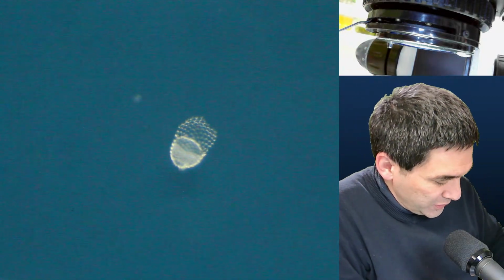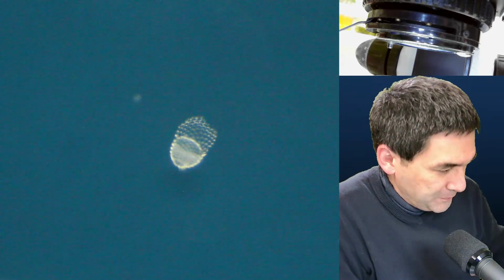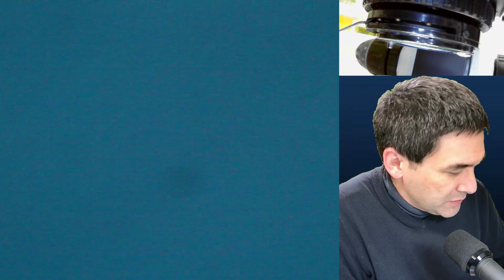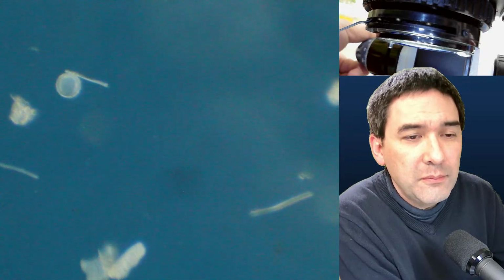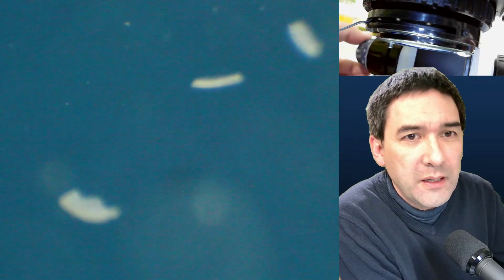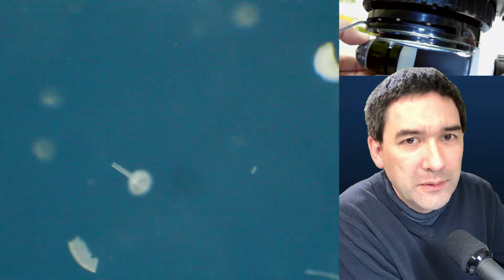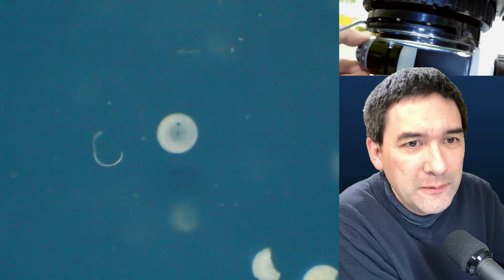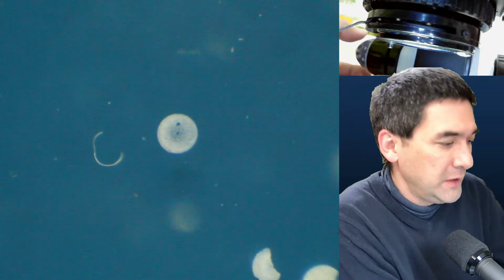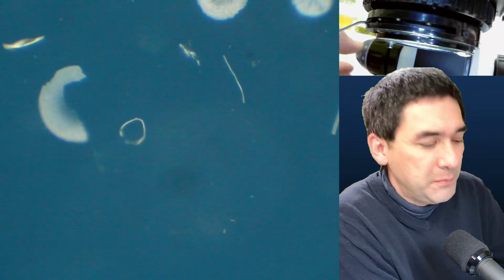Okay, I'm going to show you another example that works quite nicely, and they seem to be marine diatoms. Okay, so diatom shells are also made of the same material, silica. And these are many diatoms. It's more blurry than actually when you look directly under the microscope. Yeah, so the image quality is not quite as satisfactory, unfortunately. But here again, you're able to see a pretty big contrast.